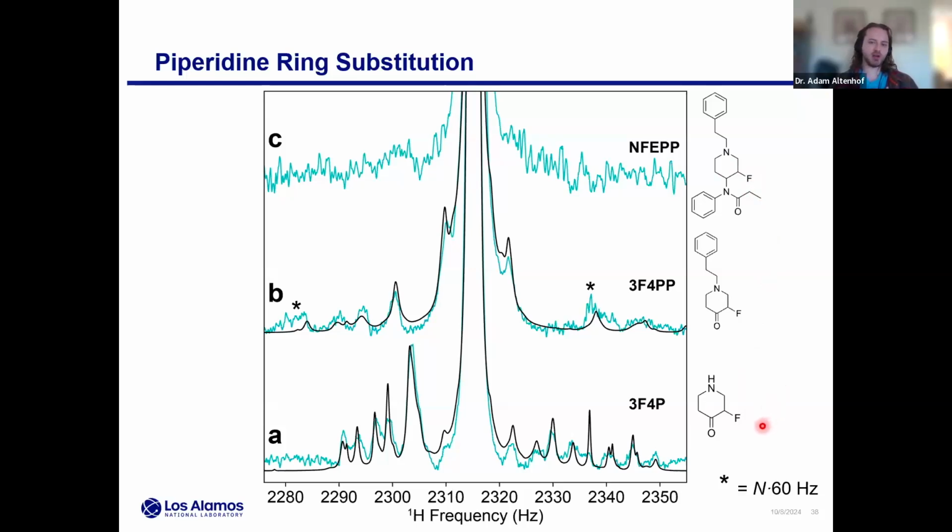what I wanted to see here was if I take the starting reagent, the intermediate, and the final fentanyl, let's assume that the J couplings are probably going to change, and then I should get a unique spectrum in every case. So what we're seeing initially is, because we have just this 2-bond J coupling from fluorine to hydrogen, that's about a 50 hertz coupling. That's what really gets the spectrum started. And then we see all the other couplings as perturbations to that.